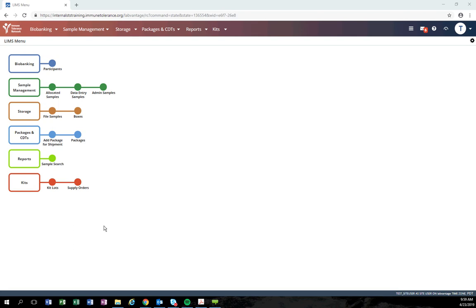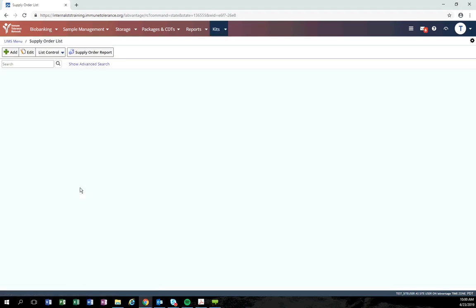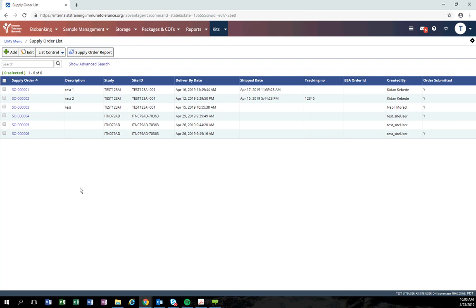To start an order, click the supply order trim stop. The system will open the supplier list page. This will show any supply order that has been entered for any of the sites you have access to.